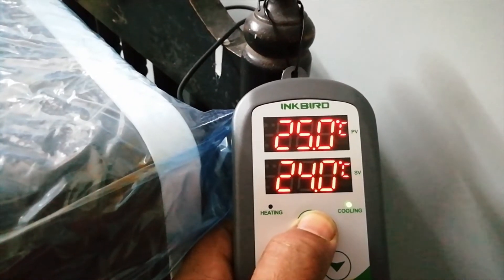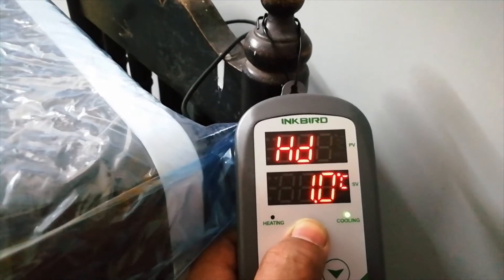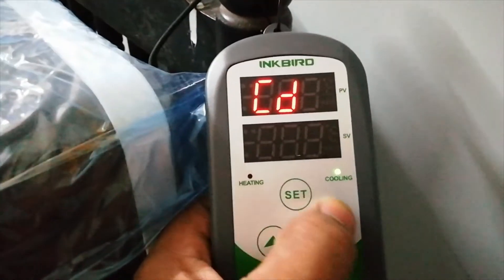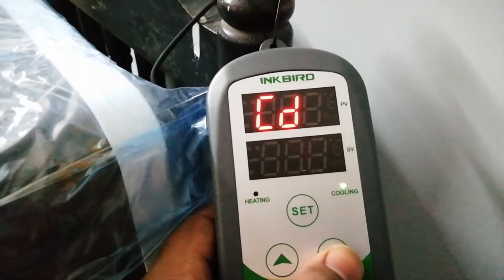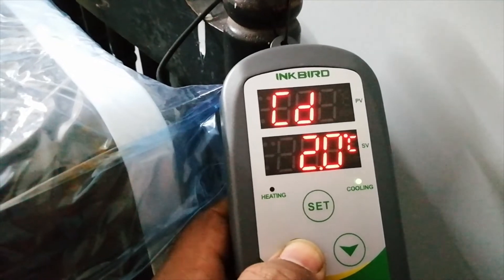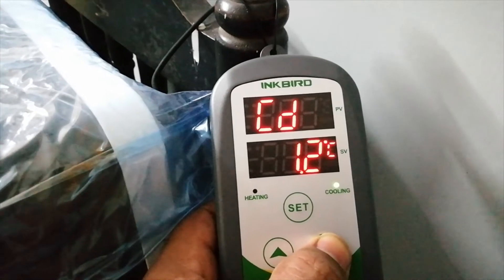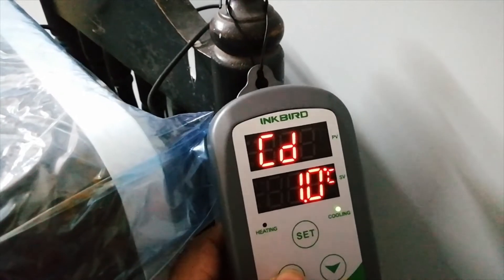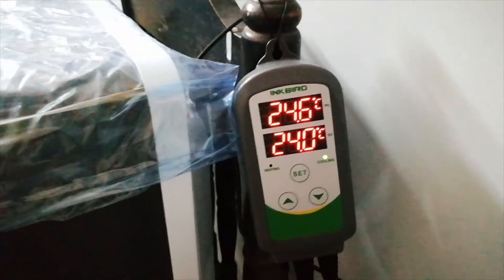Right now I have 24 set, and 25 is the maximum trigger point. This is the cooling differential — I am setting a one-degree cooling difference. You can increase it to two degrees, but I am going with one degree. So when the temperature reaches 25 degrees Celsius, the fridge will automatically switch on.